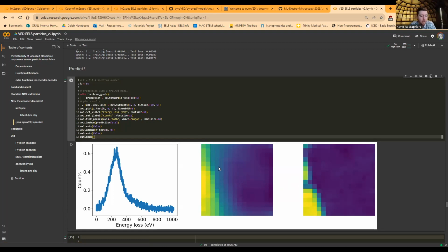We think this is because of any slight tilt in the specimen. You might be picking up different spectral features that are more sensitive at that tilt, and so just because of the tilt, you may be able to resolve which side of the structure you are actually on. So that's actually a very peculiar and curious thing here. But anyways, back to the real world, I guess.